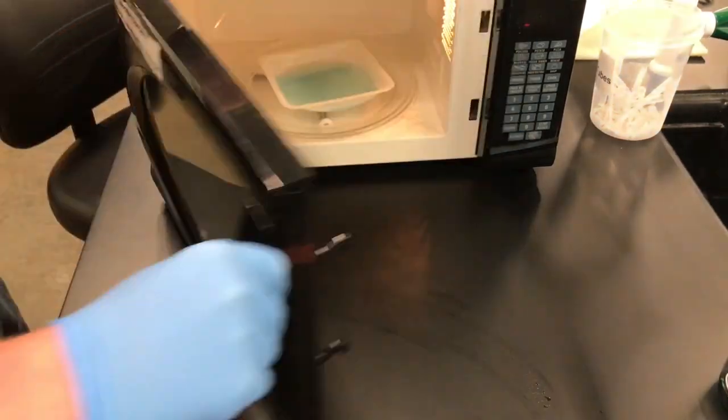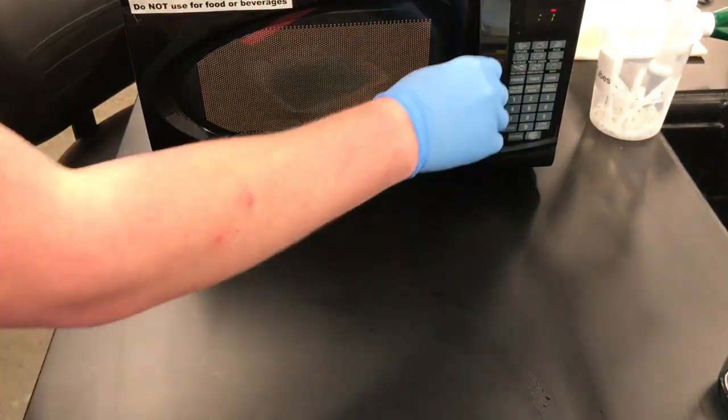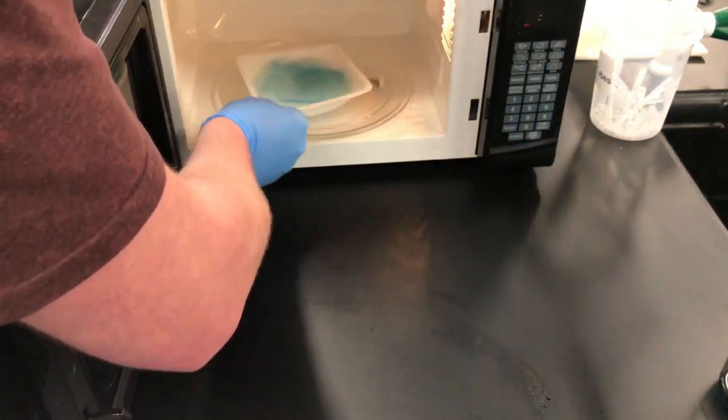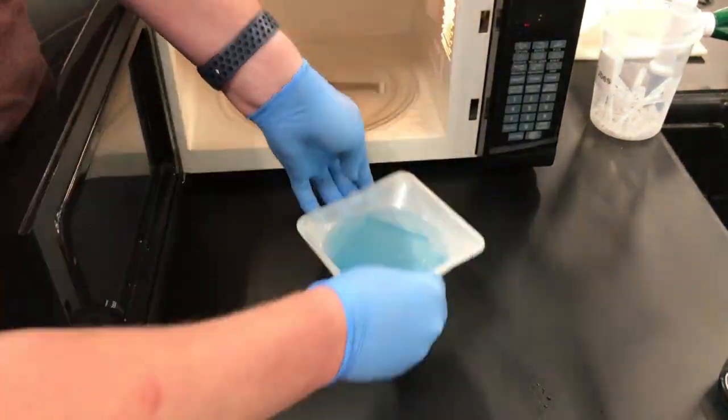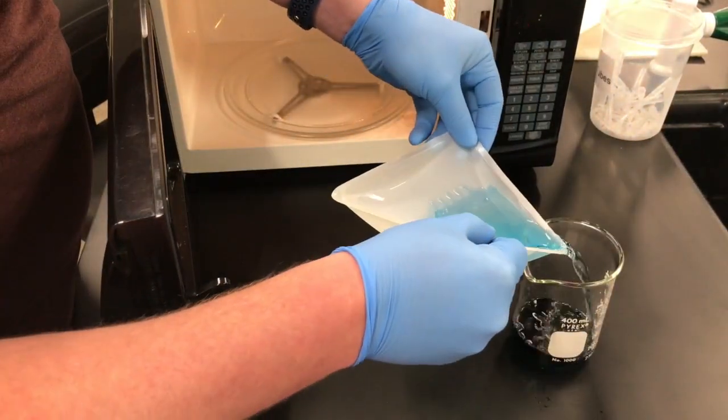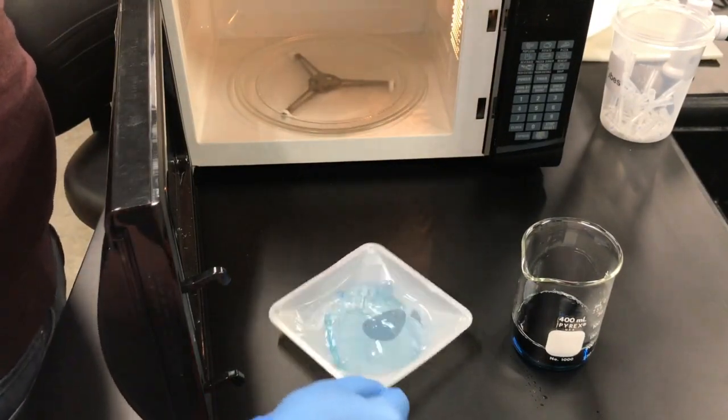The destaining process is a mixture of microwaving the gel and water for about 10 seconds, taking it out, mixing it up, and then doing it again and again. Eventually the dye will come out of the gel but it will stay bound to the protein. This way we'll get the high contrast and we'll be able to see our protein bands.